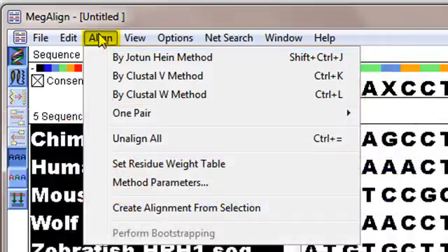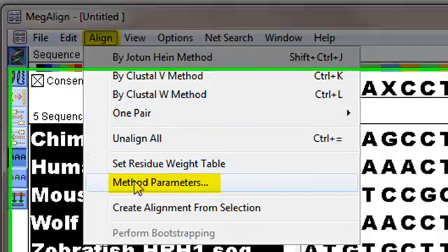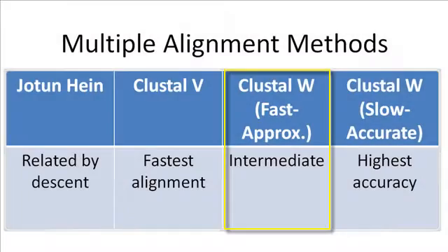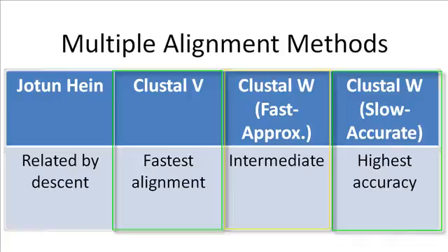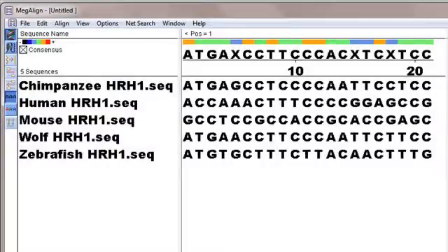The two versions of Clustal-W are selected using the command Align Method Parameters. The Fast Approximate version of Clustal-W is intermediate in speed and accuracy between the Clustal-V and the Slow Accurate Clustal-W methods. If you need to use Clustal-W for large numbers of sequences, then you also want to set the ends of your sequences based on how they align, consider doing the following.